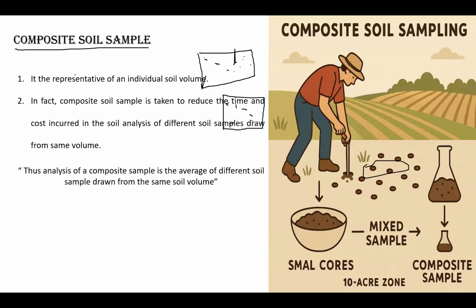Again, going back to our example, in this particular field we are taking different soil samples and making those samples into one particular volume. Okay, that is your soil sample.